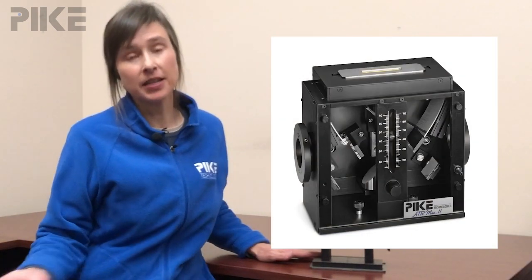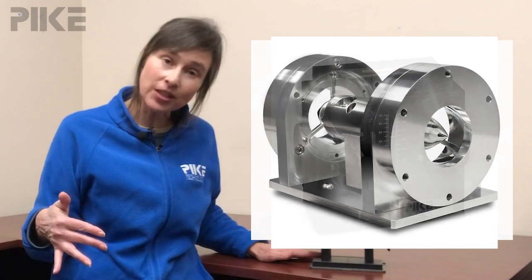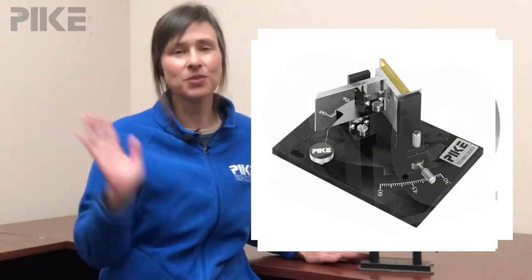Hello and welcome to the tip of the week. Today let's talk about multiple reflection ATR. I have the HATR with me today, but we also have our ATR Max that is multiple reflection, the Jetstream and the VATR. All those are multiple reflection.